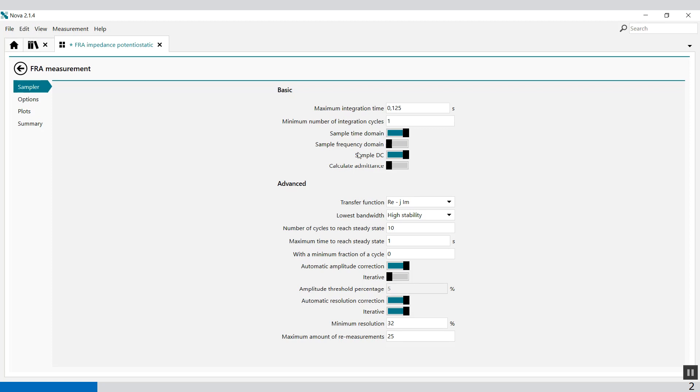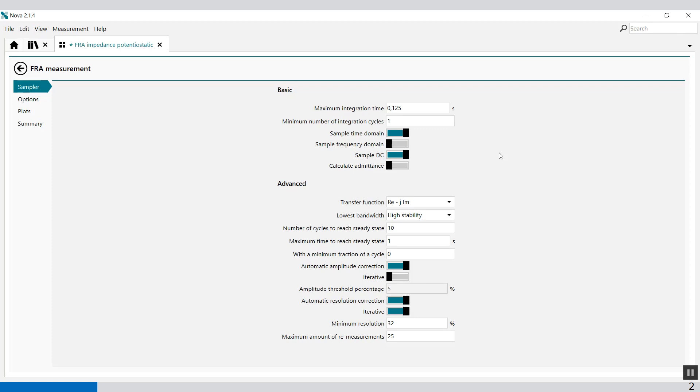You can also sample the frequency domain. This defines if the frequency domain information should be sampled during an FRA measurement using the provided toggle. The frequency domain information consists of the calculated FFT results obtained from the measured time domain. The frequency domain information can be used to evaluate the measured frequency contribution.